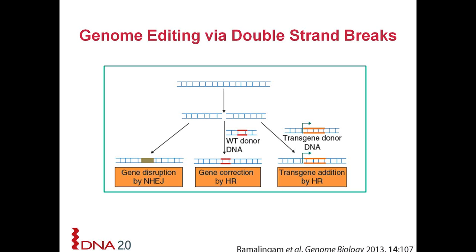And how we measure it is when we do CRISPR, when we target a given site, after expression we'll get single colonies and we'll try to screen individual single colonies by sequencing or by PCR amplifying this region of interest. So this green site here would presumably have been mutated. So we would simply PCR amplify this region and then sequence to see what happened at this site here. Because we know exactly where the site is, we know exactly where the cut happens, we know exactly where to expect indels or mutations. So that's how we measure indel frequency. It's just a measure of how often we get back the wild type sequence versus a frame shift.